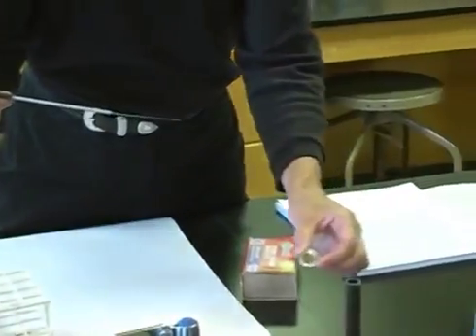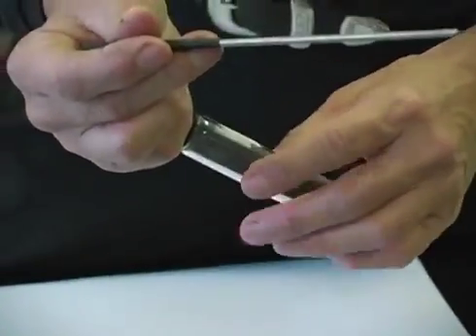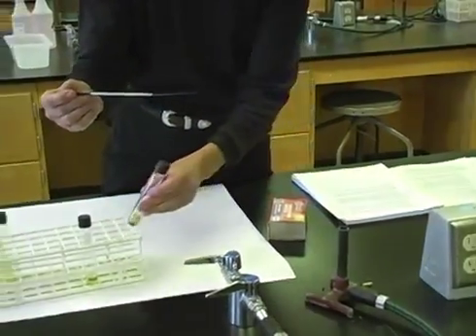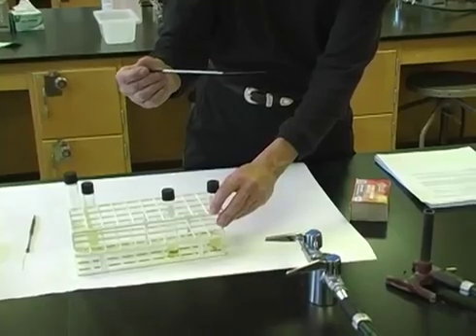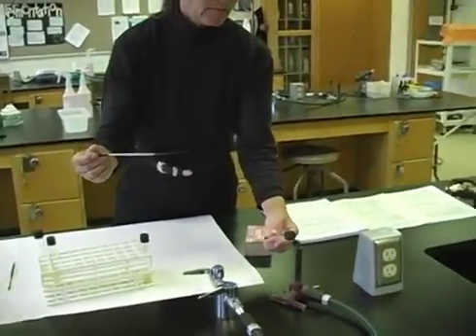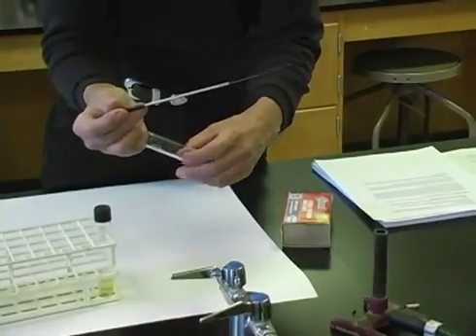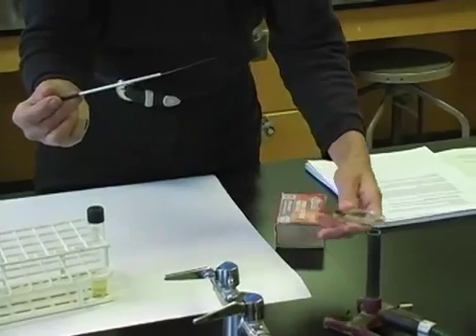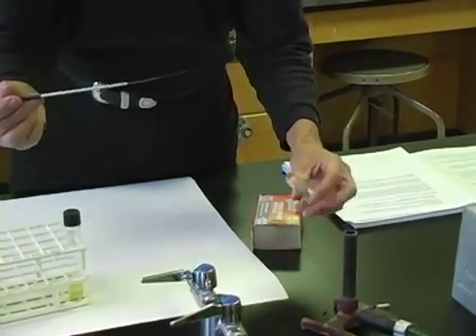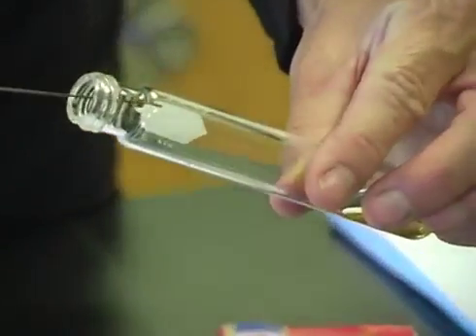remove my loop, and then once again flame the lips of my tube, replace the cap, gently screw it on, flame the cap, place my original tube into the test tube rack. I then will flame the cap of my fresh tube of broth 3 times, hold in a near horizontal position, flame the lips 3 times, and now I will insert my loop without touching the outside of the tube.